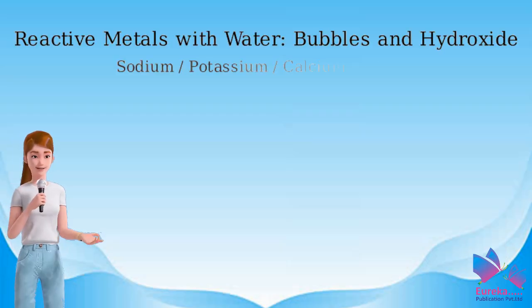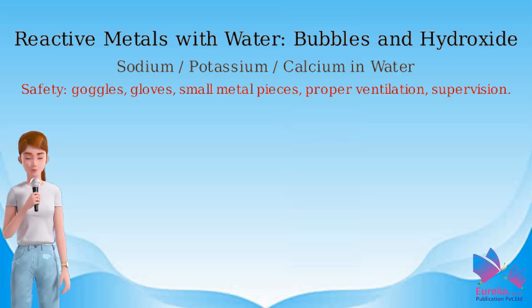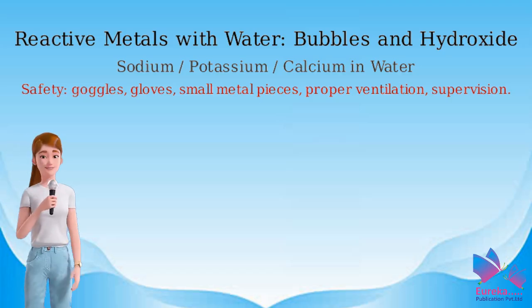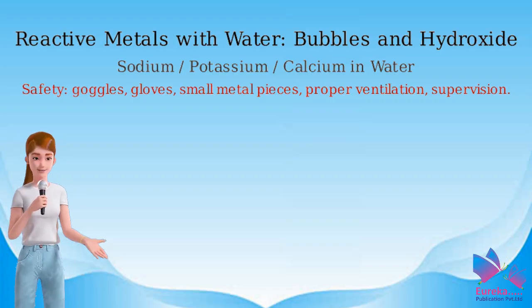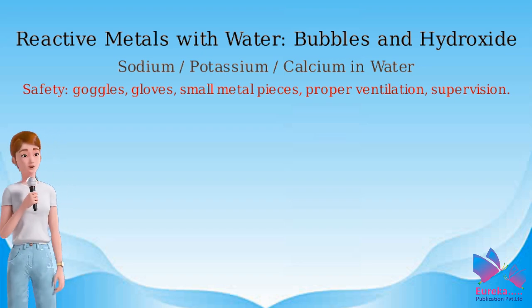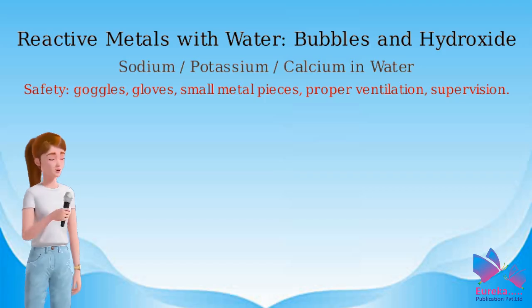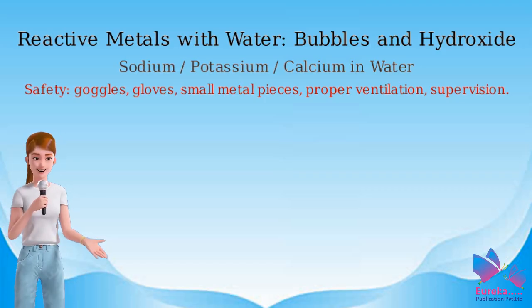In this video, we will safely demonstrate the reaction of water in a test tube with a small piece of a reactive metal: sodium, potassium, or calcium. We will observe two key things: 1, hydrogen gas bubbles evolving, and 2, the formation of a metallic hydroxide at the bottom for calcium.